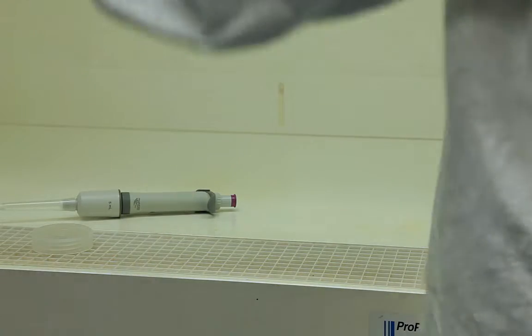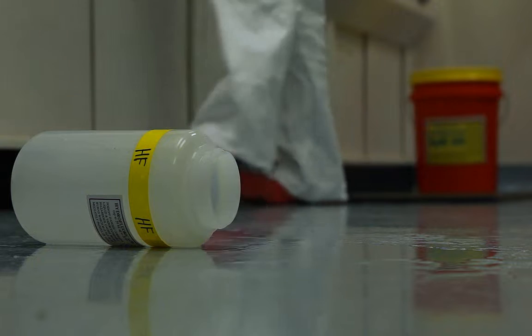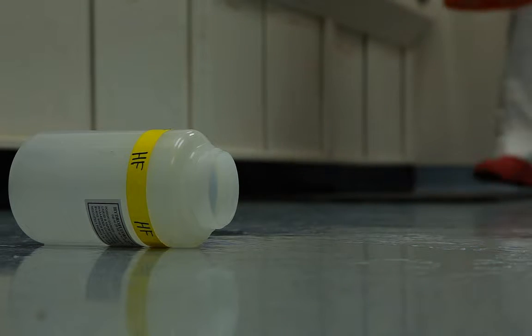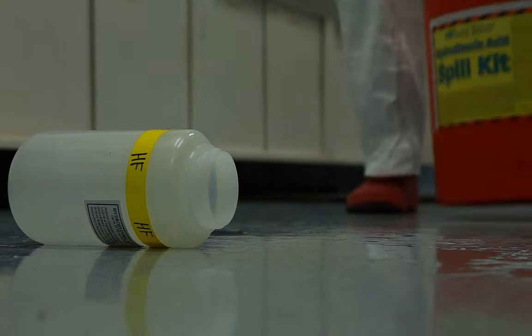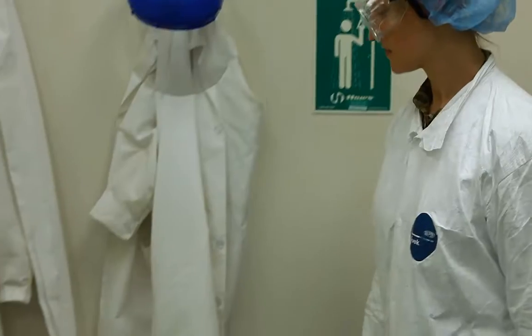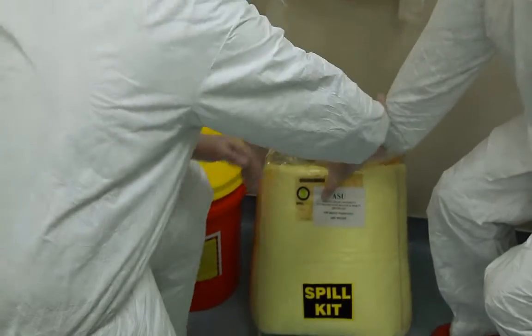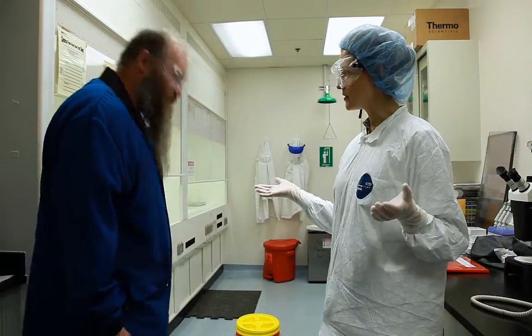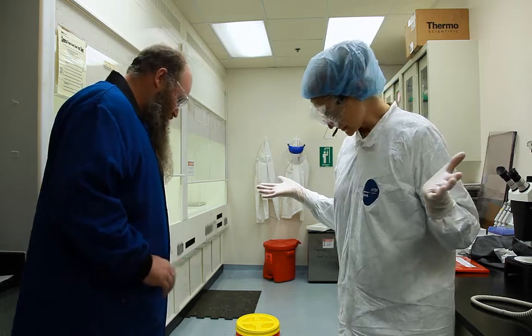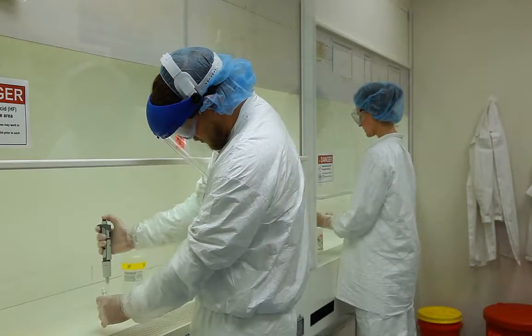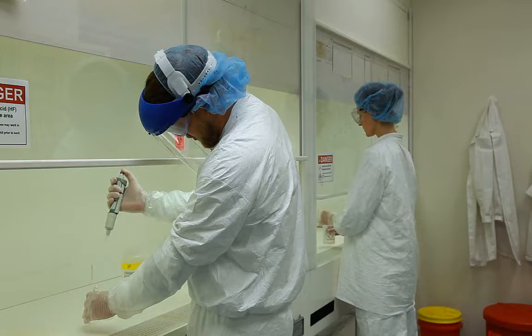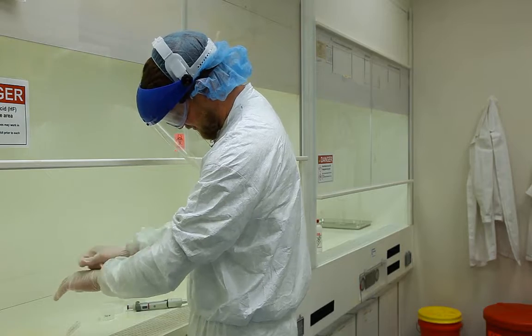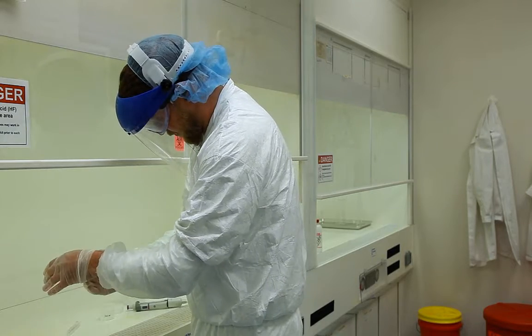If an HF spill occurs, regardless of concentration, consideration for clean-ups should be evaluated based on personal experience, location, volume and concentration of the spilled acid. If you choose to mitigate or clean-up to spill, follow the steps outlined in your SOP utilizing your lab's HF spill kit and notify your supervisor. If you are still not comfortable, immediately contact ASU EH&S to perform the cleanup. Should HF come in contact with your glove, carefully remove both gloves and as a precaution, rinse the potentially affected area for five minutes. If you suspect permeation through a glove tear, utilize your available antidote and call 911.